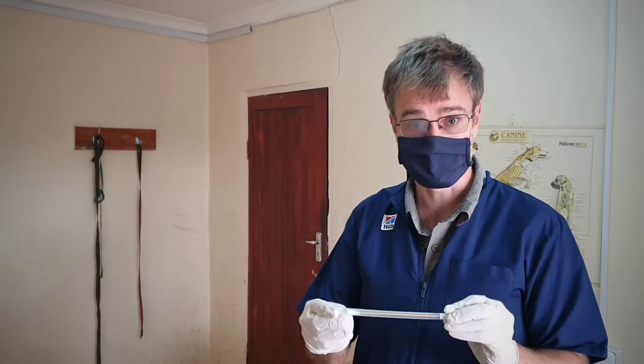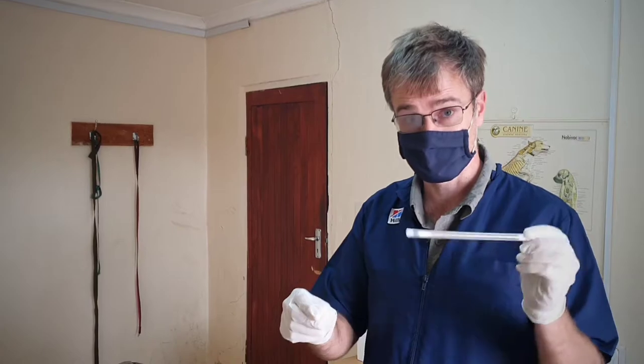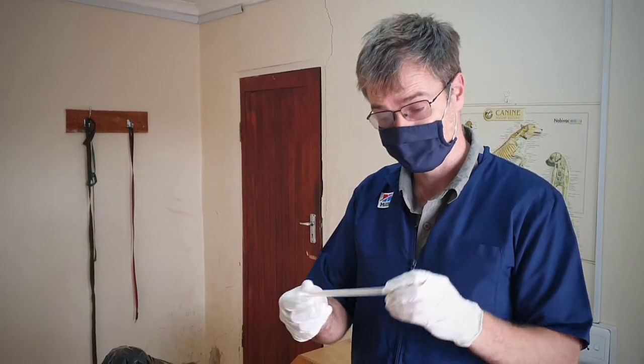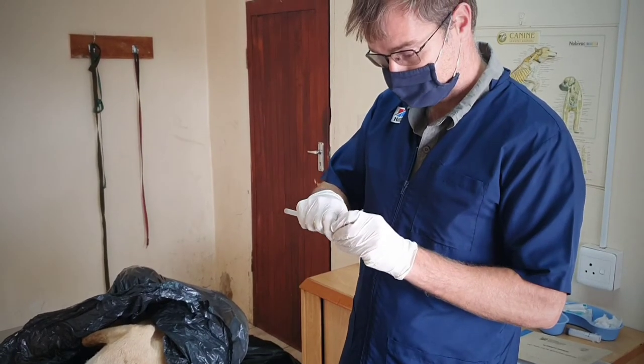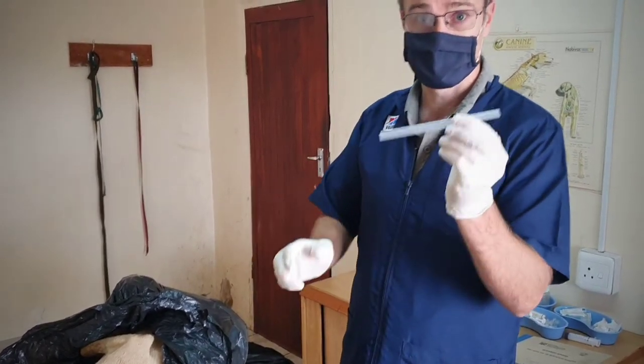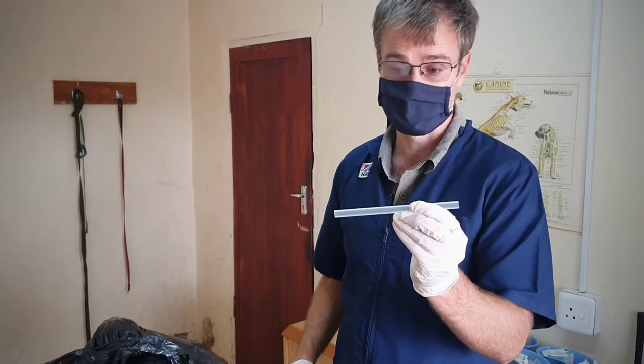We haven't been using straws as such. What I found works quite well is if we use the tracheal swabs that we use for the guarded swab that we use for ostriches. We just actually use the casing from it, take off the end, take off the stopper from the other end, and there we have quite a stiff straw that we use.